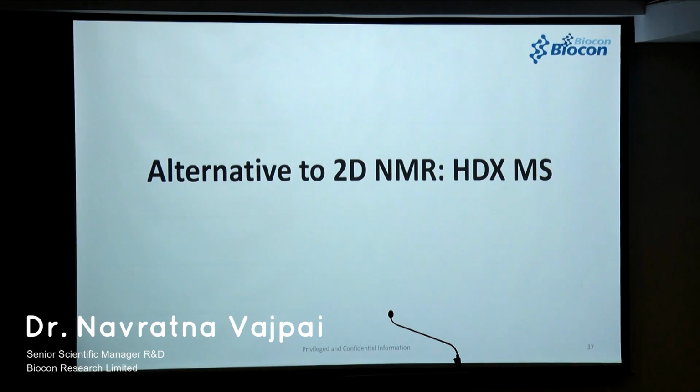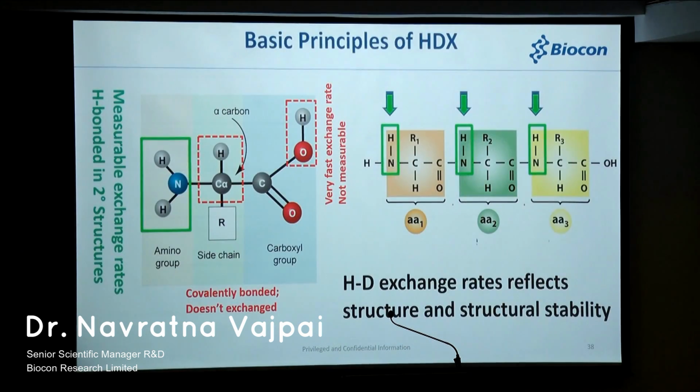So now what is the alternative? Now NMR, again, the problem is higher concentration. Sometimes you may get it, sometimes you may not. Now you need some alternative way. Again, the problem for me was somebody else talking about HDX-MS. So Deepak Thakur took that chance today. He was the first speaker, he talked about HDX-MS. I thought, okay, I'll change my slides to make it slightly simpler, just to show some examples. He talked about some theory, so I'll just show what we see.